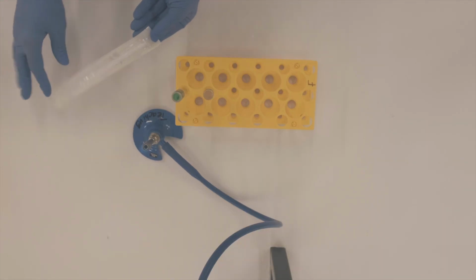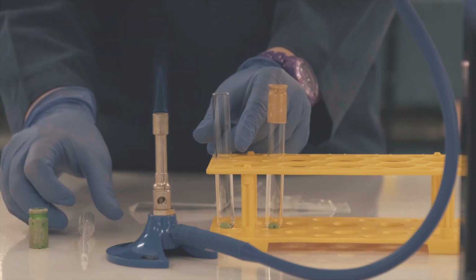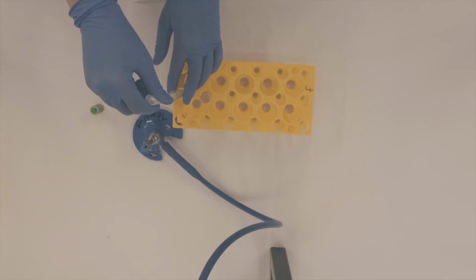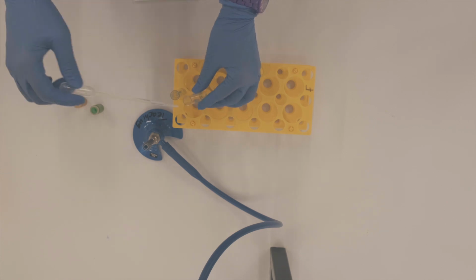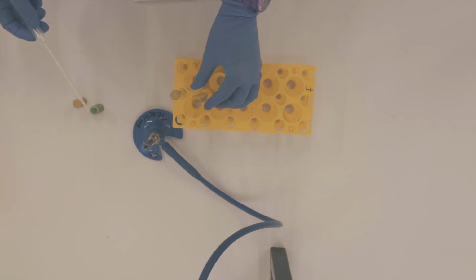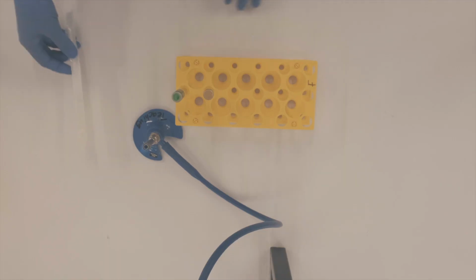Next, let's look at transferring liquid broth. Again, write down all the mistakes you can spot. Let's watch that again with the mistakes in aseptic technique highlighted this time round.